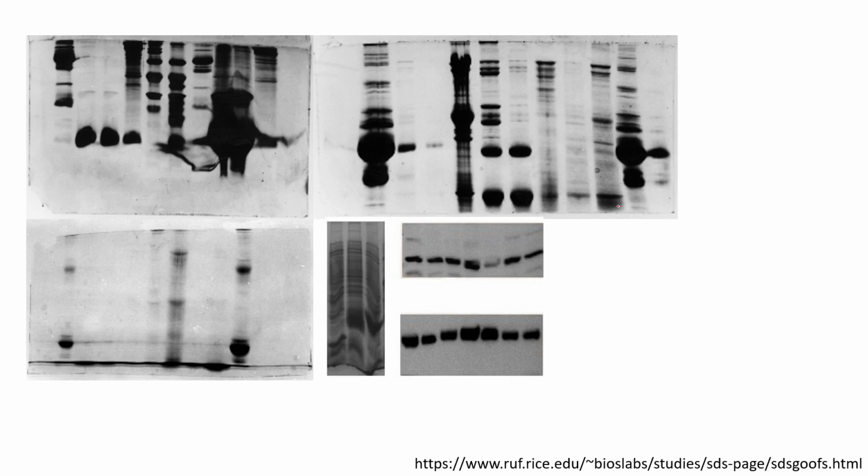So I have attached some examples of defects in the gel. These kinds of streak lines that you can see here are vertical streaking. This is also a problem due to overloading of sample. In these two lanes, you can see the sample has been overloaded, and because the concentration of protein is so high, it is impossible for SDS-PAGE to resolve the gel into separate bands. In this lane you can see we have separate bands, right? But in this lane, can you differentiate between two bands? No, right? Because everything has merged together, because so much sample has been loaded.